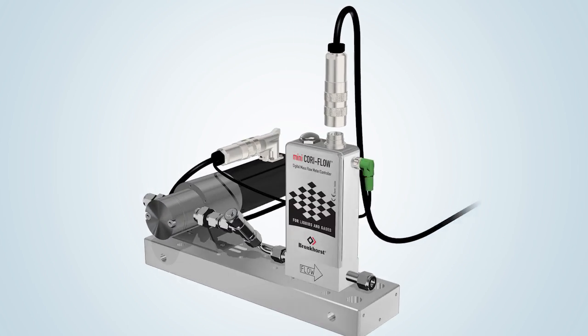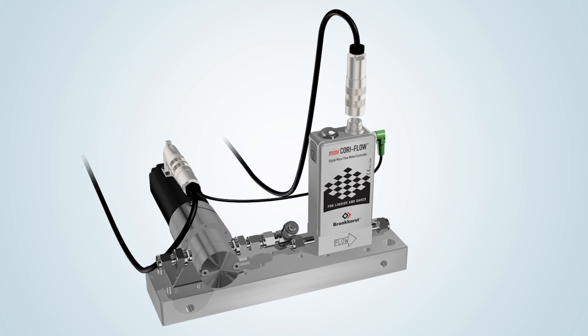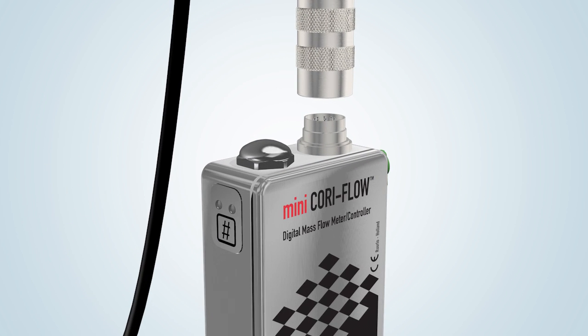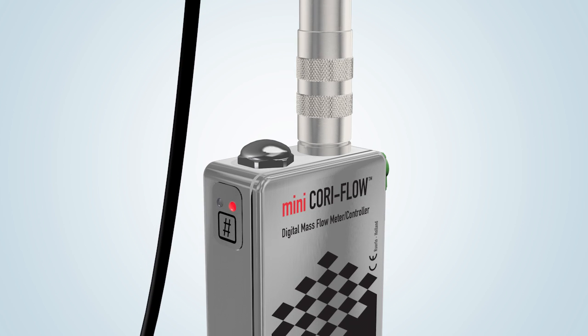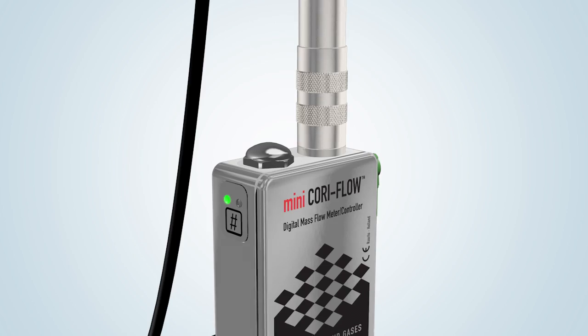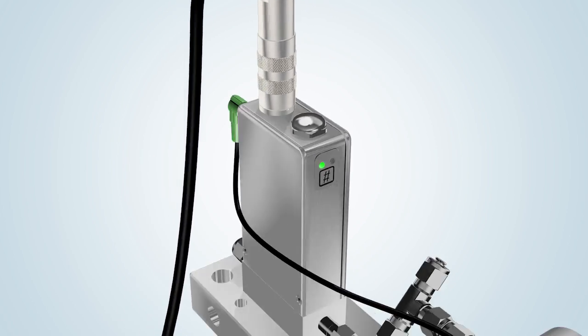A Bronkhorst Mini CoriFlow instrument requires a voltage of between 15 and 24 volts. When the supply voltage is connected, the LEDs show the current status. The instrument is ready for use when the green LED lights up.